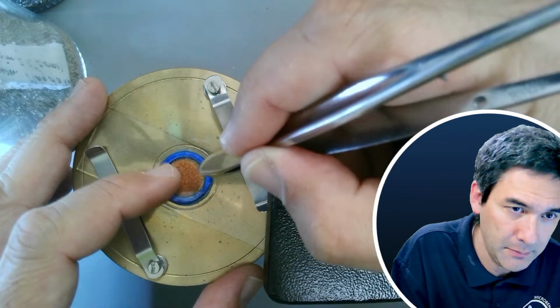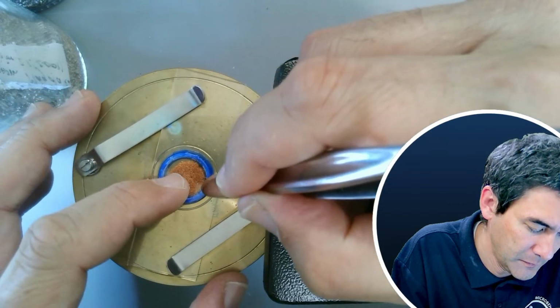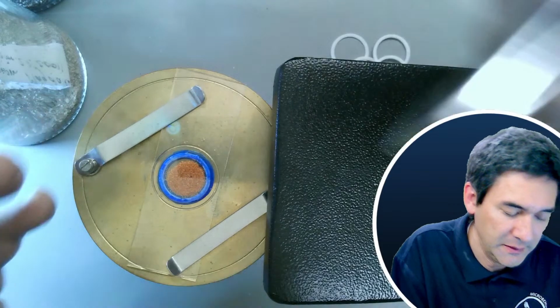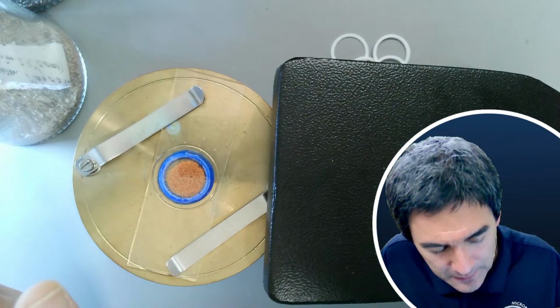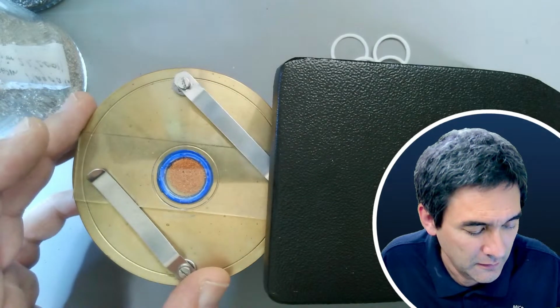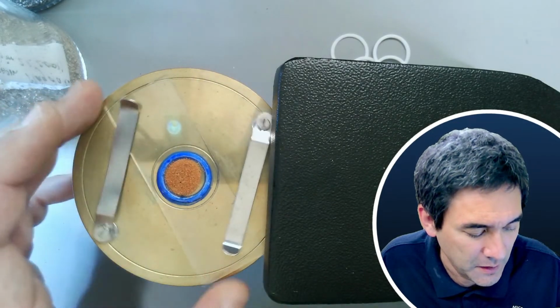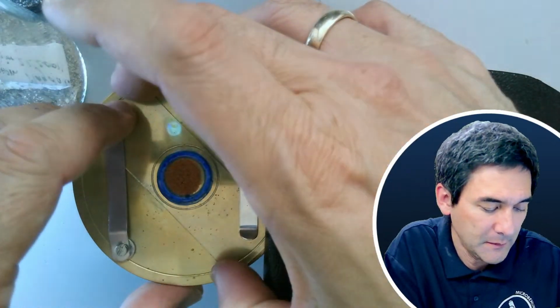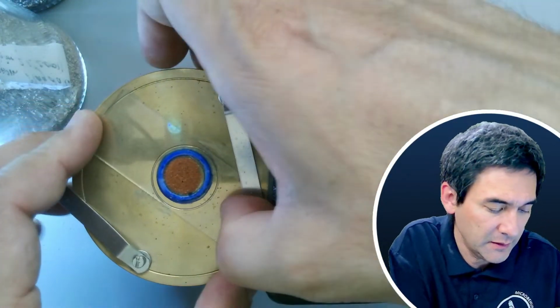Okay, tap, tap, tap. And I hope that this is stable enough. I have no idea. Okay, that's the first slide. So, you know what? Let's put it under the microscope and let's see how this actually looks.